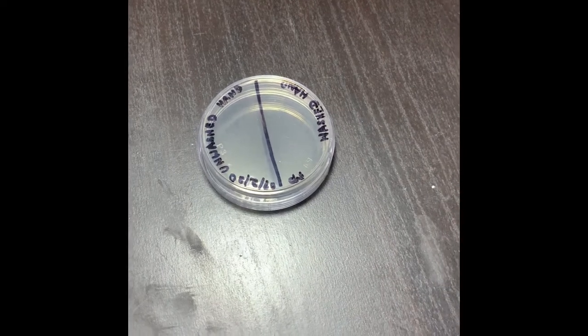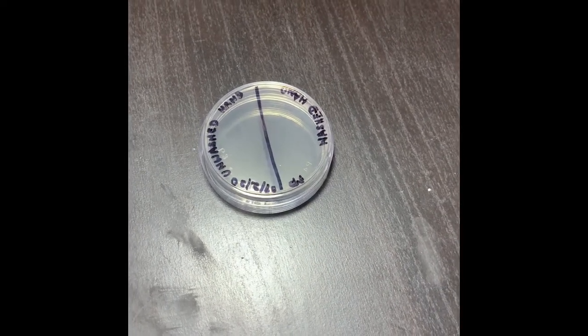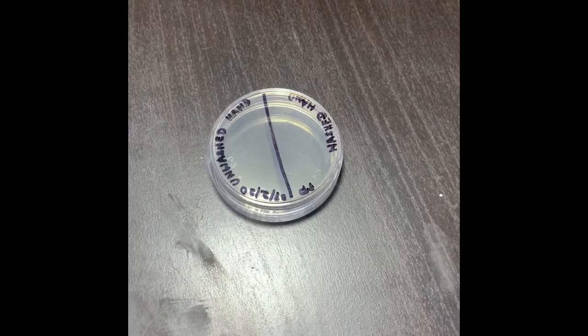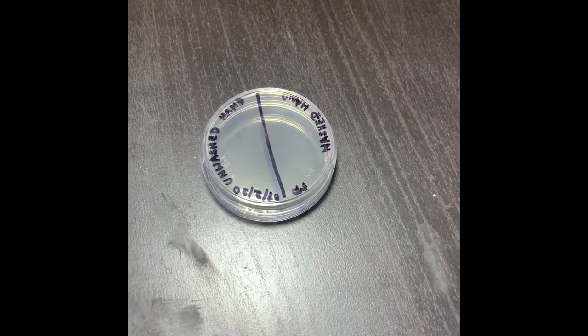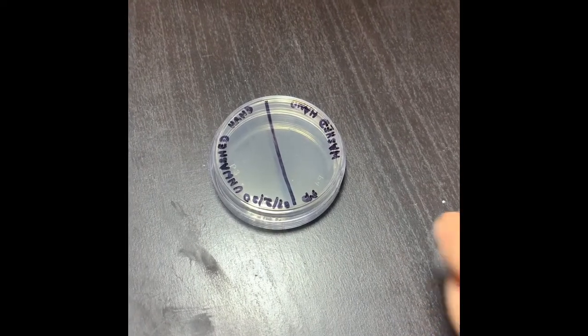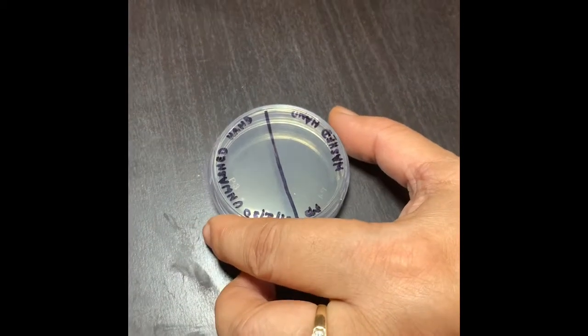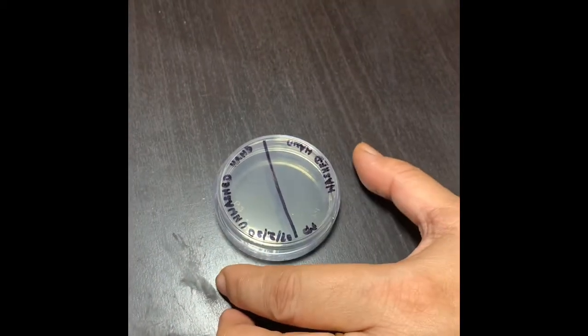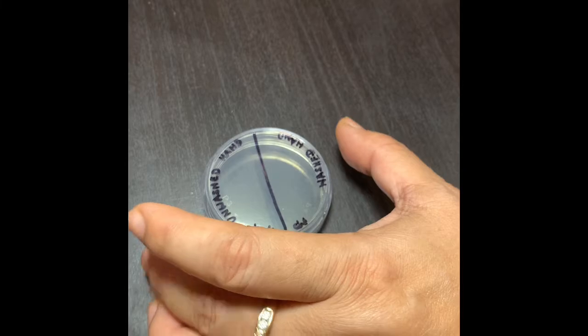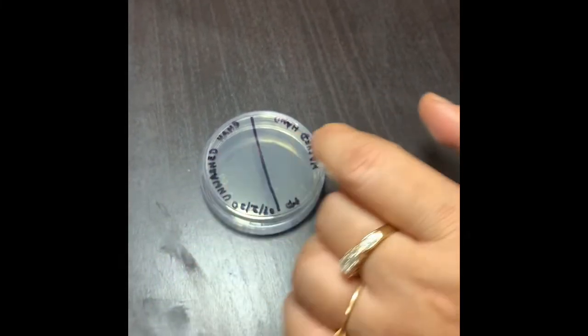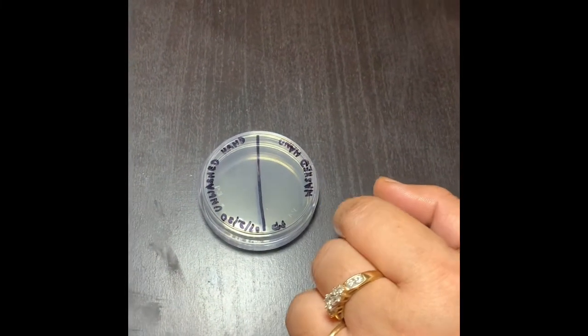I'm going to give you the demo of Lab 8, which is hand washing and normal flora. I have taken this agar plate and divided it into two equal halves. In one half I marked unwashed hand and the other half I marked washed hand.